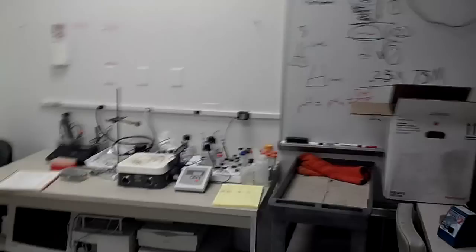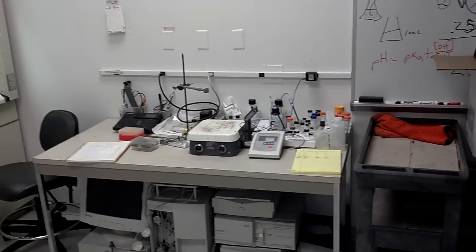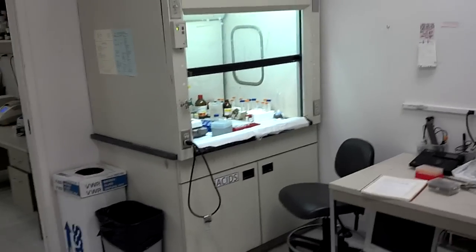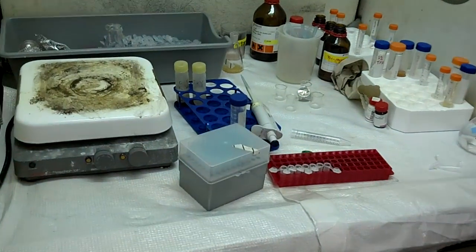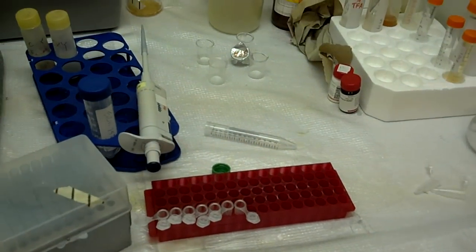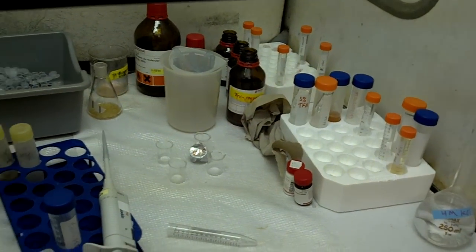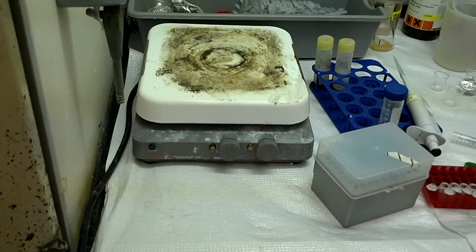This is another one of our rooms. This is where we do a lot of work. This is where we make our solutions up, check the pH. This is the hood that a lot of people use and share that I'm currently working in. As you can see, I look like I'm doing big things when really I'm not. It's mostly waste containers. A hot plate, stirred plate in case somebody wants to heat something or stir something.